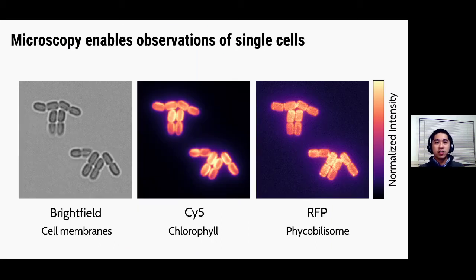So here are examples of images that we collect on the microscope. On the left is a brightfield image, which is basically formed by the light that is transmitted through the sample. And as I'll explain on the next slide, we use these brightfield images to identify cells in the image. This middle image here was collected using the Cy5 filter set, and this filter set has a long pass red emission filter, which basically lets through mainly chlorophyll fluorescence. Now finally, we will acquire images using the RFP filter set, which transmits mainly phycobilisome fluorescence.